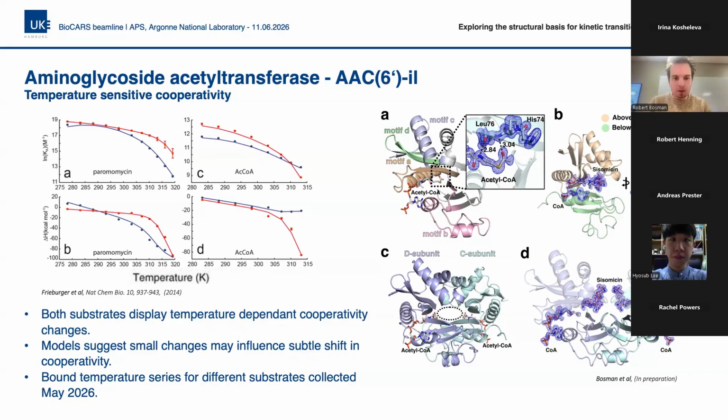that dimers are heavily involved in the process of allostery. Well, basically have to be by definition, in this cooperative process. And it's thought that very subtle changes at the dimer interface are what's driving this temperature change, which is unsurprising. And we can start to explore those changes as a function of temperature, which, as you can see here, goes from around 280 to 320, so quite moderate temperatures. That's degrees Kelvin, I should say, rather than Celsius. So fairly around the range that we can now measure in.